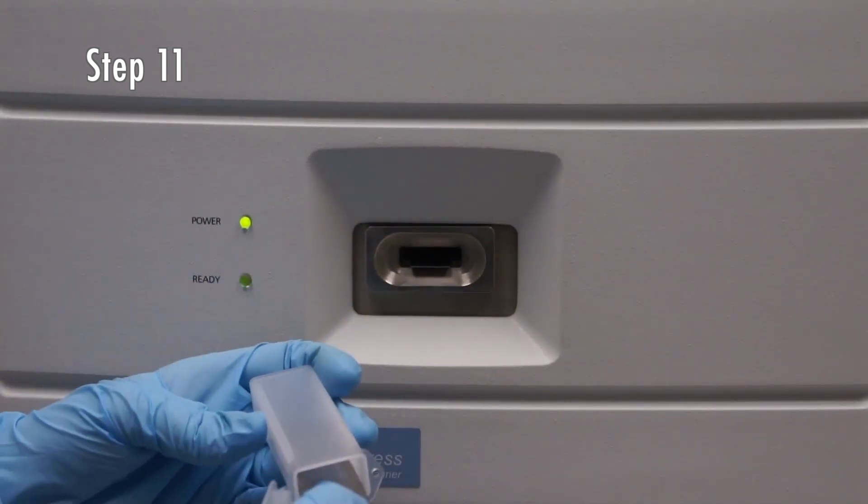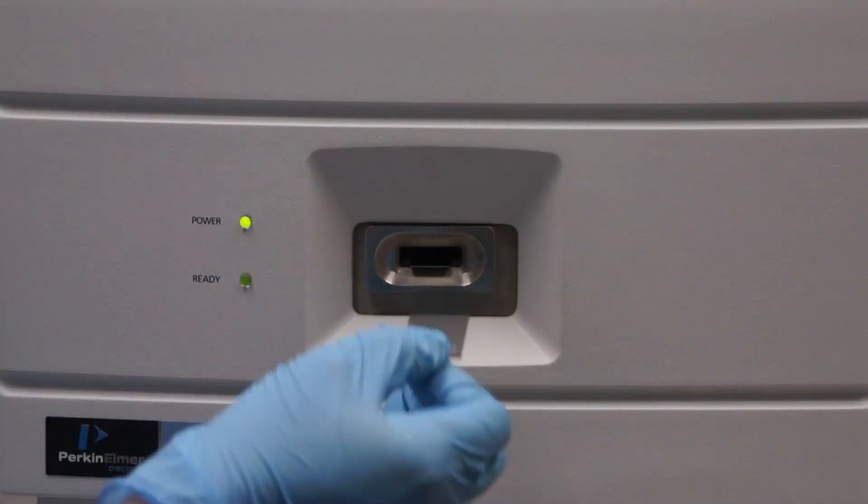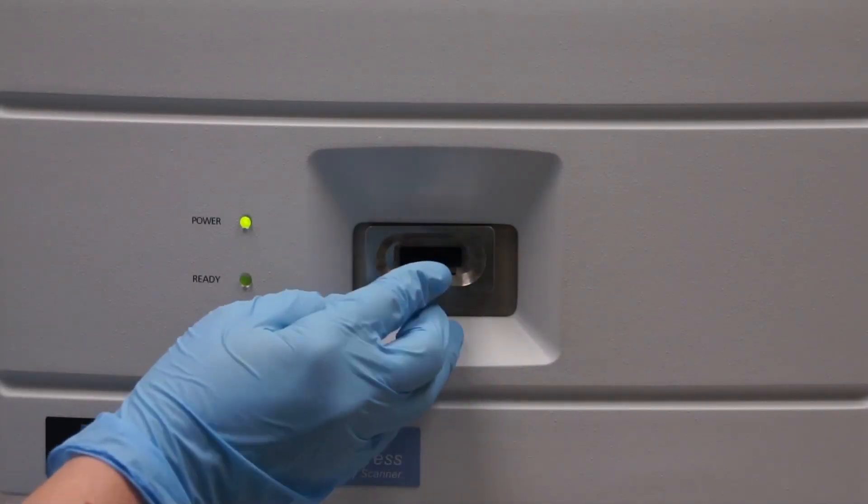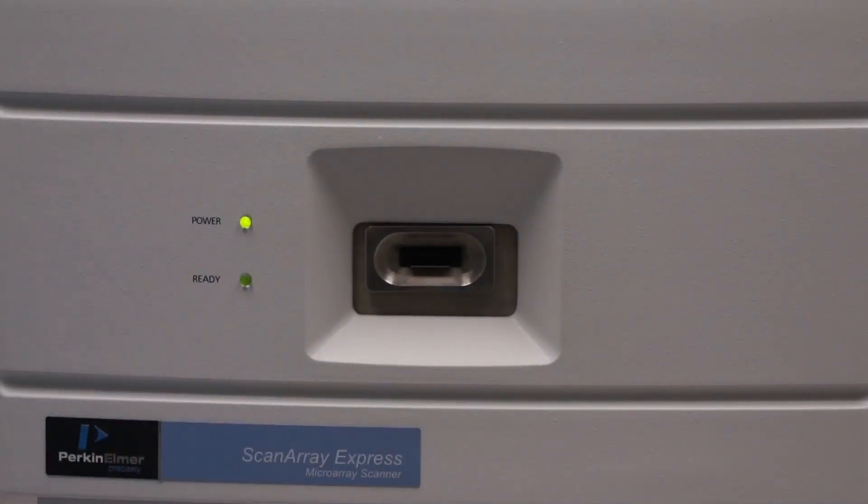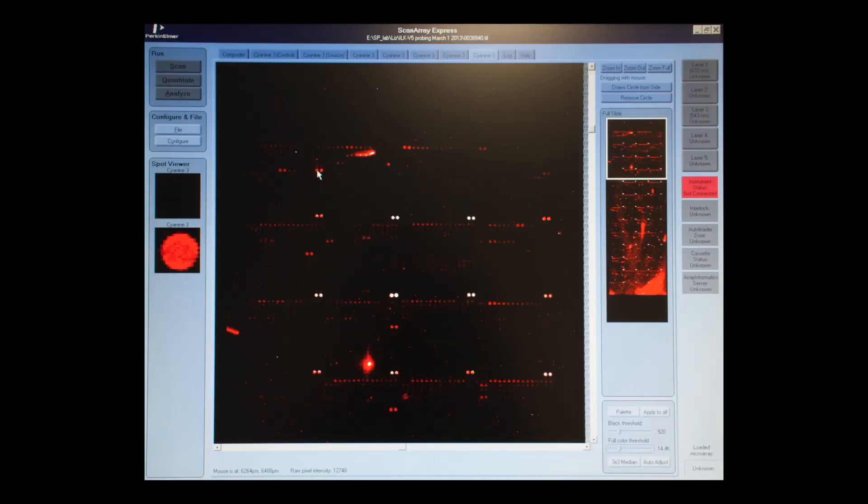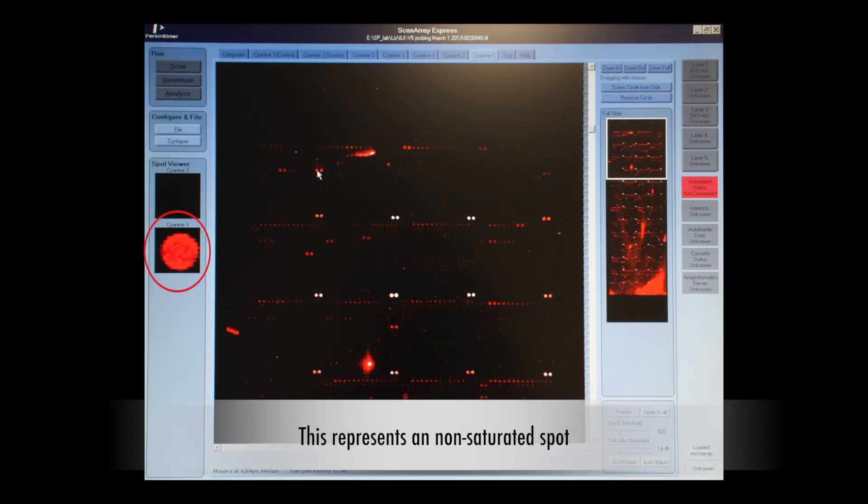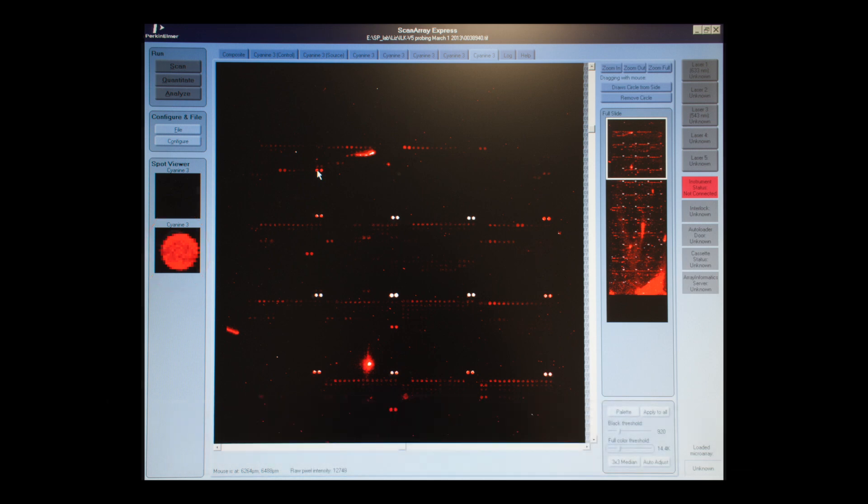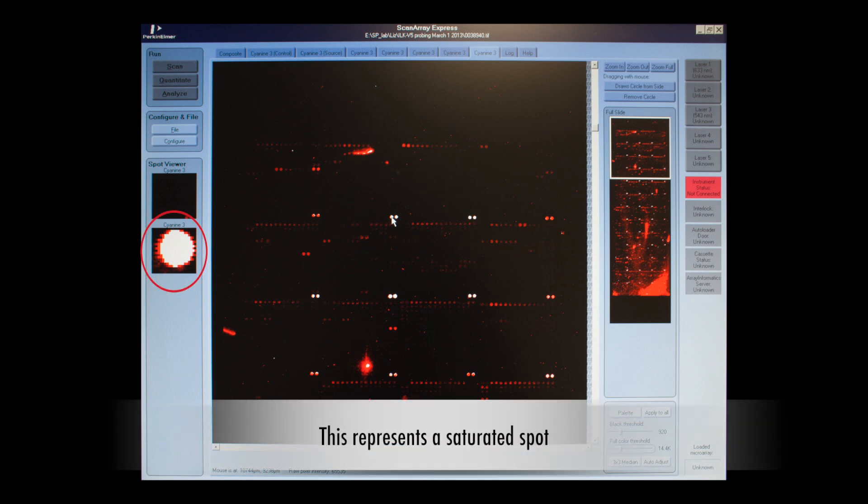Load the array into the scanner after warming up the lasers. Scan the array at a low resolution at 60 PMT to determine the location of the proteins on the slide and the brightness of the signal. Try different PMTs until the maximum number of non-saturated spots appear. Saturated spots will appear white depending on how your program colors the signal. Be sure to scan all of the slides at high resolution with the same PMT within a single experiment.